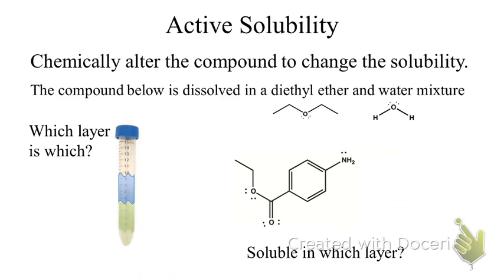The aqueous is on top. Okay, why would you put the aqueous layer on top? It's less dense. Okay, so you're coming to the right point. We need to know the density of each of these compounds. Okay, how would you ever find the density of each of the compounds?